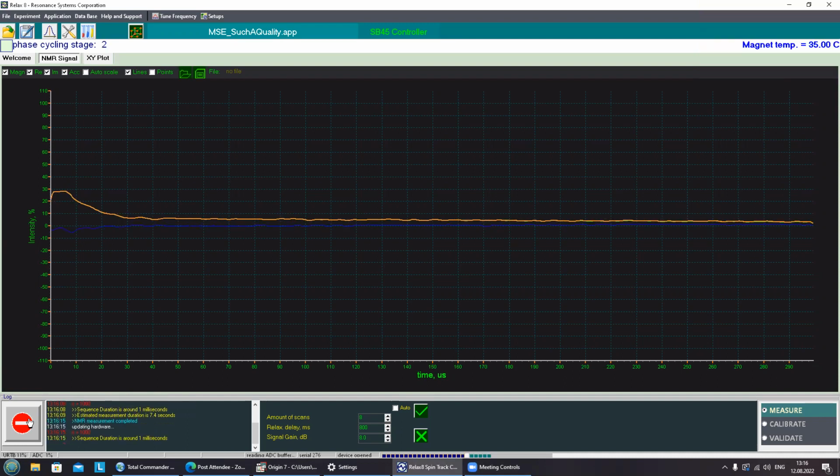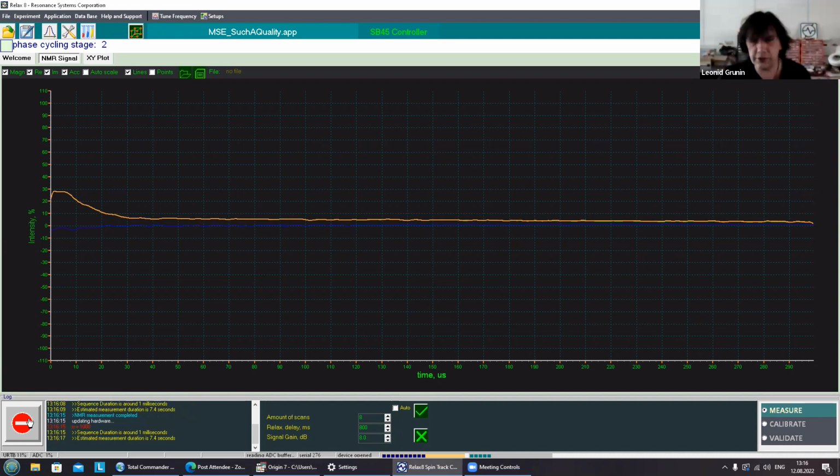We need to tell people that in this free induction decay recorded by Magic Sandwich Echo, you see the water contribution, this light line. The water contribution is the long component, and you see the polymer contribution, which is a solid component. So you see both signals. Let's say soft, it's not really liquid. It's soft, and it is rigid.